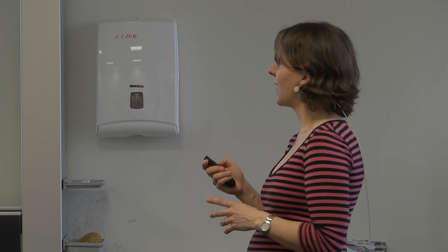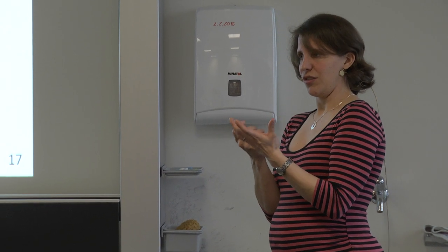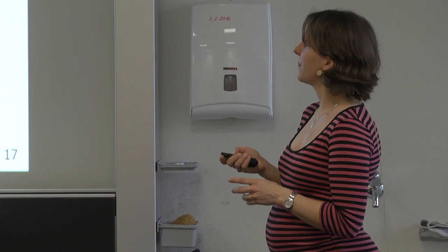But the beauty with synthetic peptides is that you do not increase the complexity of your sample by just spiking one peptide in, and you are pretty sure about this reference. When you spike it in at an appropriate amount where you can nicely detect it, it really increases your confidence that you're measuring the right thing. But it does not need to be a highly purified, well concentration-controlled peptide if you plan to do relative quantification. Okay.